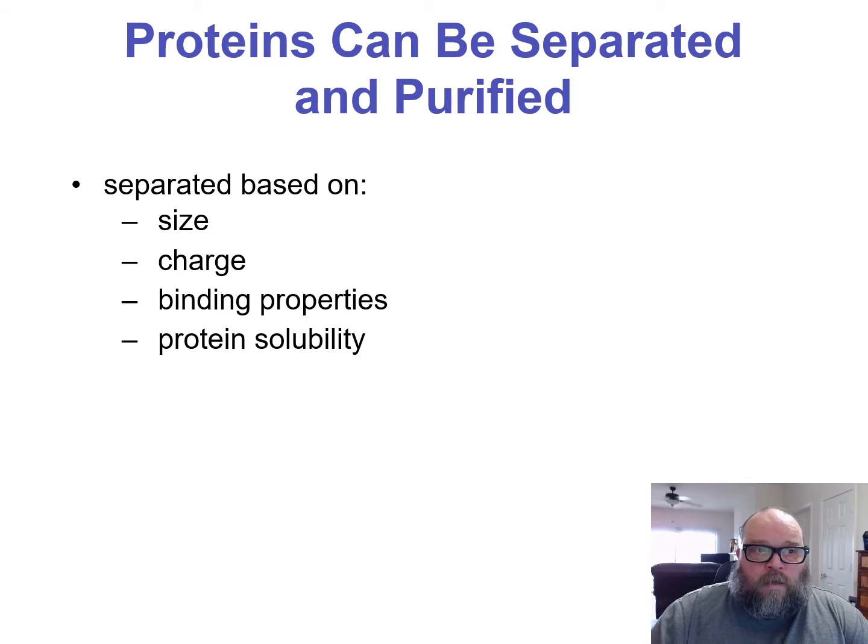Well, over the decades, we've developed certain methodologies for doing this. We can separate out a protein or a set of proteins based on size, overall charge, binding properties, what it will interact with, and its solubilities.